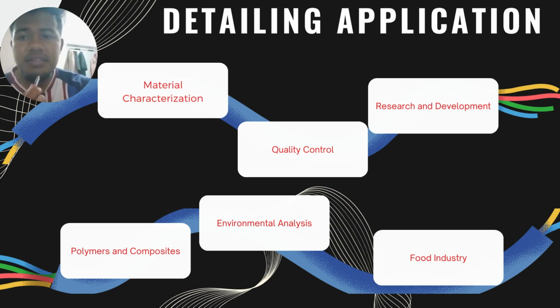Environmental analysis. TGA can help in the analysis of waste materials to determine their composition and thermal decomposition characteristics. This is important for developing effective waste treatment and recycling processes.